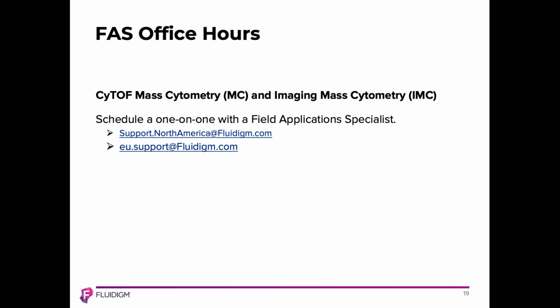The second is that, as the Newell publications show, the first of which was in 2013 and which have been coming in considerably by the year since then, they take advantage of using a mutant neutravidin, and you can refer to some of the publications or connect with your FAS, and they can get you some of that literature. They use this mutant neutravidin that has mutated protein residues that can include free cysteine residues, which is what our conjugation chemistry targets.